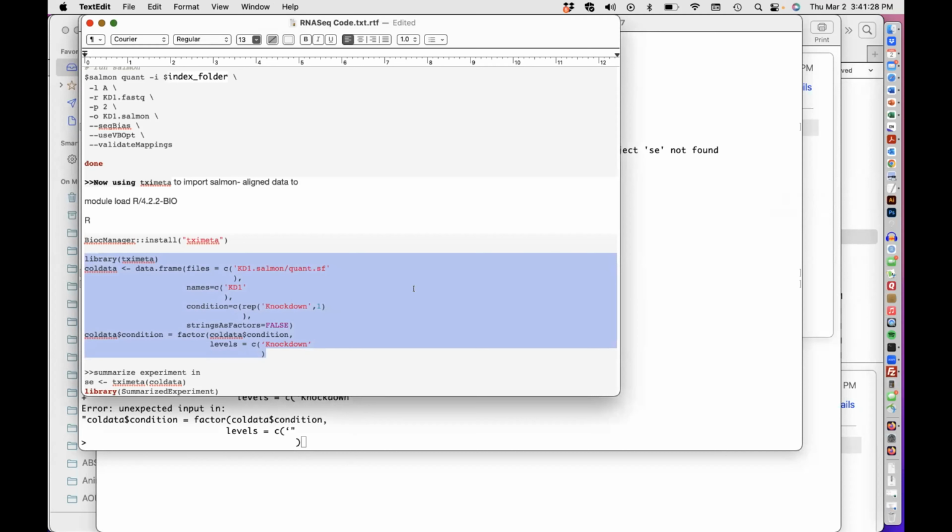So I don't have RStudio, so I was trying to just do it in the text editor, which may also create problems. I've got RStudio, but it's not opening because it's an old version.